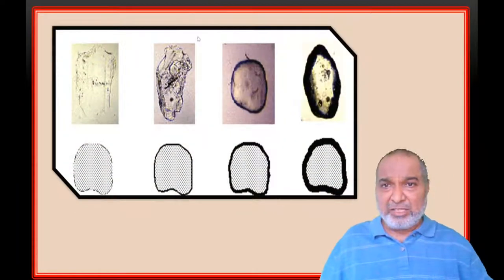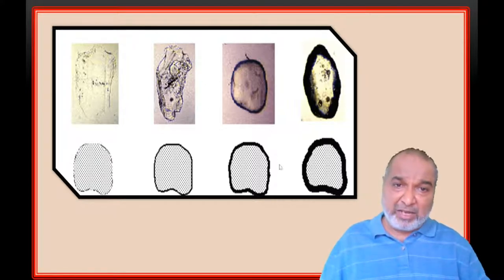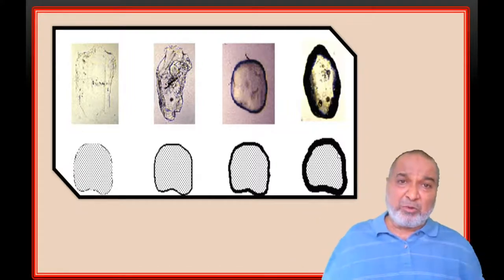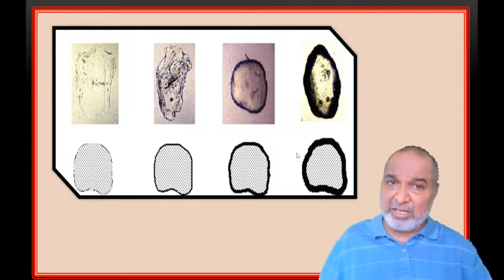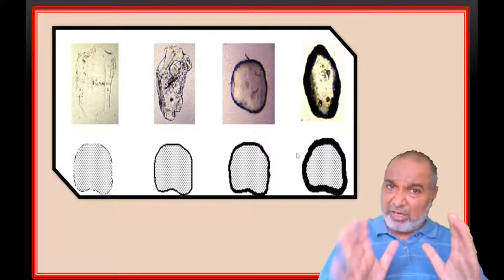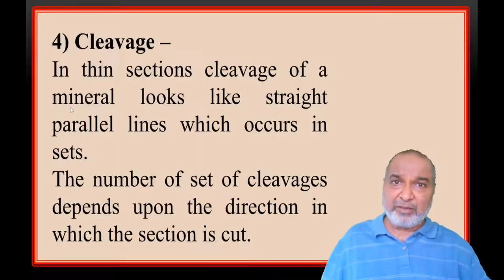Now next, we will see the scale from low to high, how it has been taken place. Yes, on the upper side we are giving you the slide. You can see the outline which cannot be recognized. So we have been showing you in this preference. It is low relief, but it is moderate. But you can see as you go towards this side, the outline goes on becoming more and more prominent. So it is high relief. Is this concept clear? I think the relief concept is clear now, so there should not be any doubt.